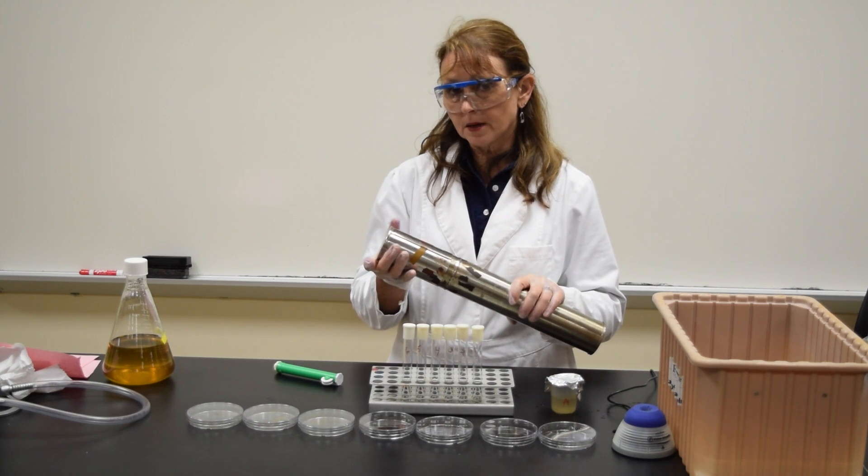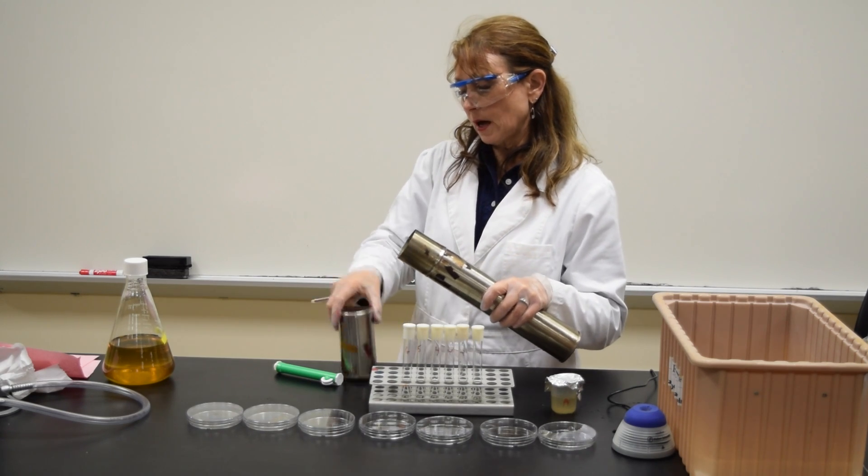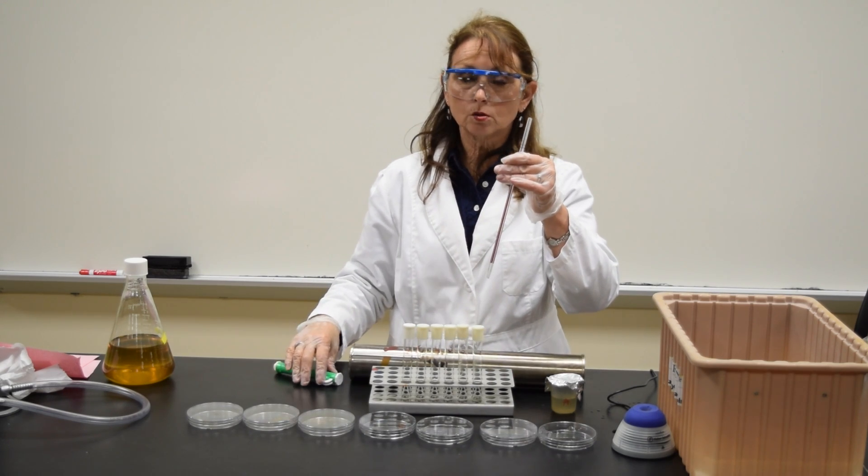I'll be using sterile pipettes from this can. Open up the can, remove a pipette. Make sure that you don't place the pipette on the bench, nor do you touch it.